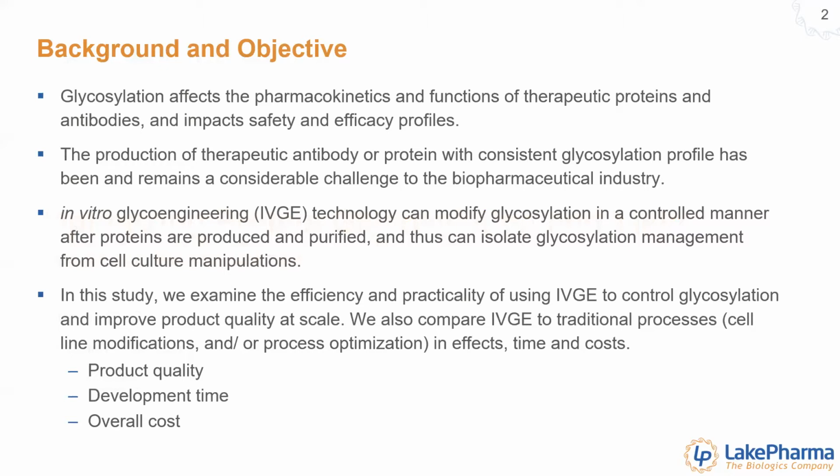In this study, we'll examine the efficiency and practicality of using IVGE to control glycosylation and improve product quality at scale. We will also compare IVGE to traditional processes, i.e. cell line modification and process optimization, with regard to effects, time, and cost.